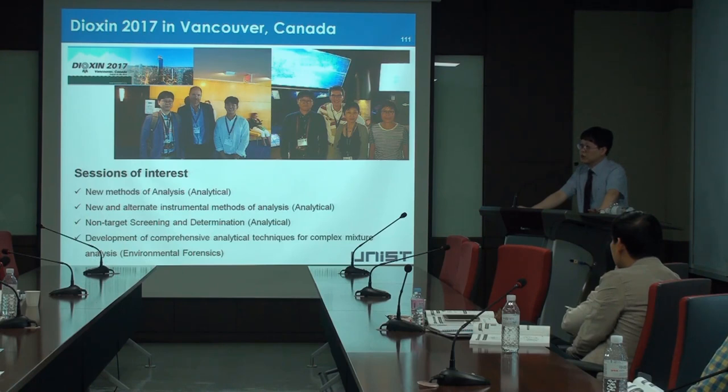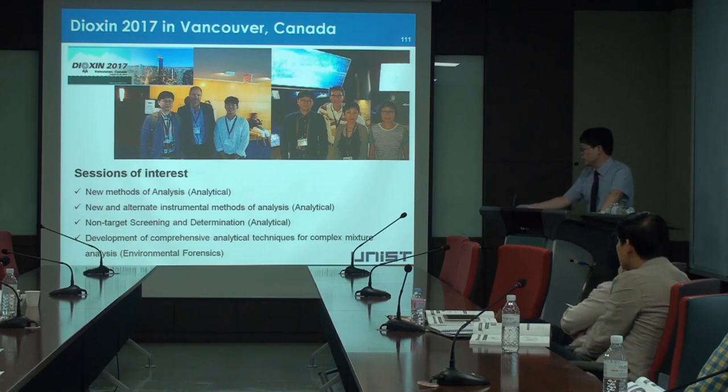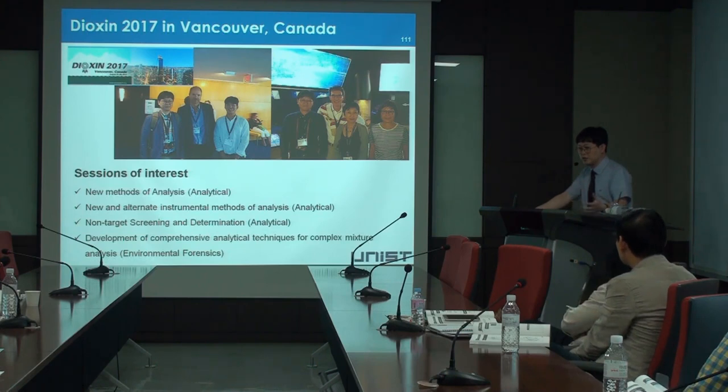There are more than 30 sessions. Among them, there are 4 sessions for new instruments. First, new methods of analysis, second, new and alternate instrument methods, third, non-target screening and determinations, and the last one, developing comprehensive techniques for complex mixtures. This is also called environmental forensics. Forensic means criminal investigation. We generally use this term forensic. Recently, we also say environmental forensic.